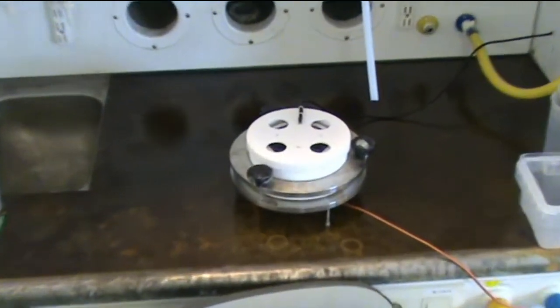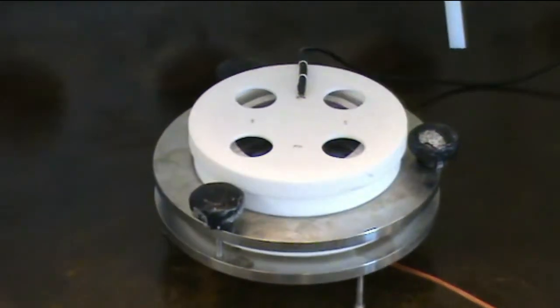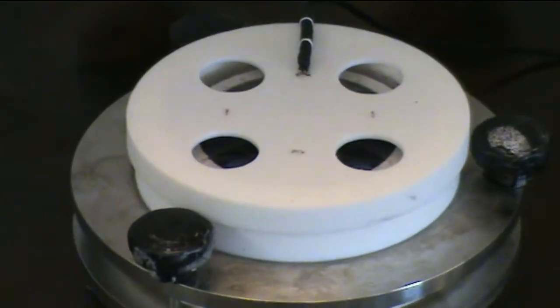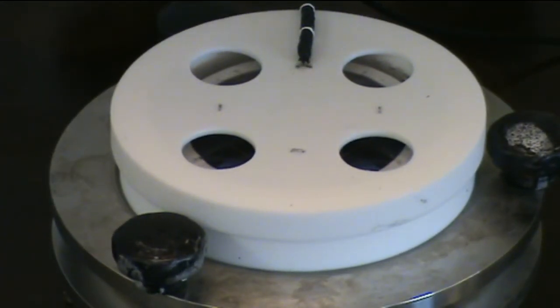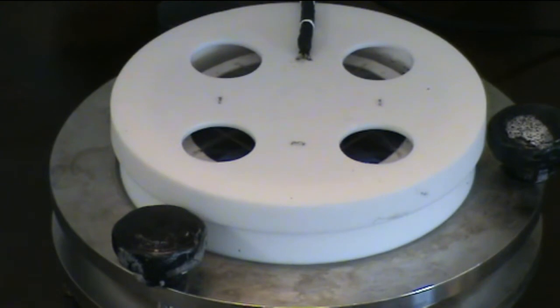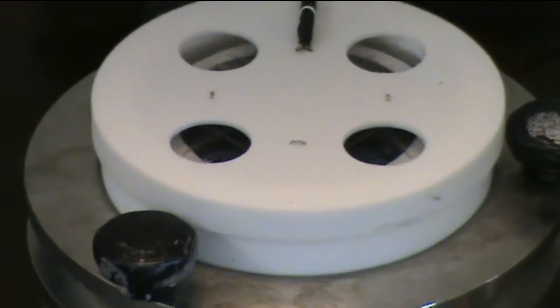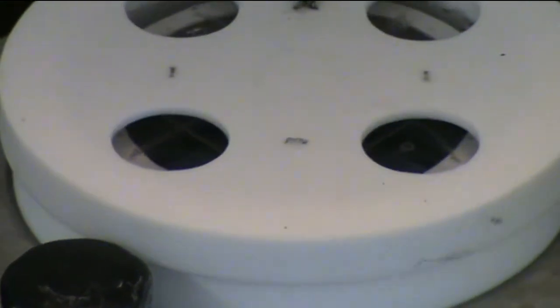I will start the etching by switching on the etching current from the power supply unit. You can see hydrogen bubbles being produced during the etching.